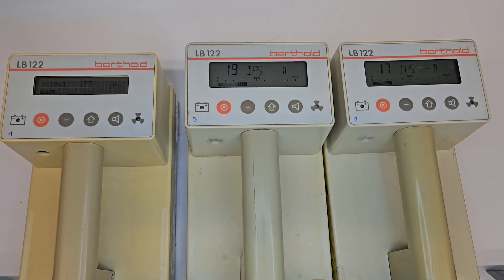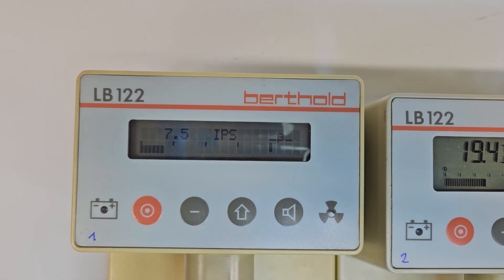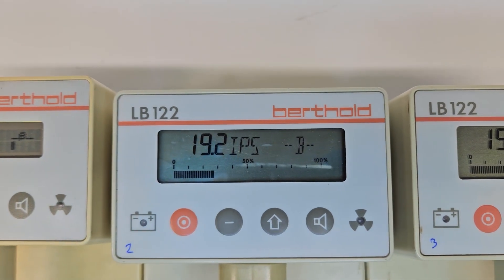Detectors — in this case contamination monitors. We have a total of four in our labs: three from Berthold, including the LB 122, one in a different version, and the KOMO 170.